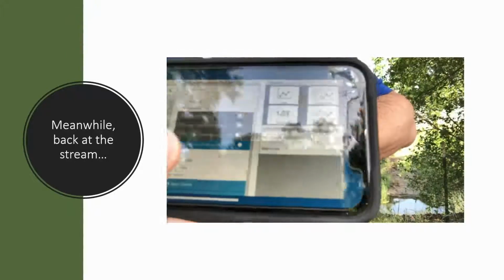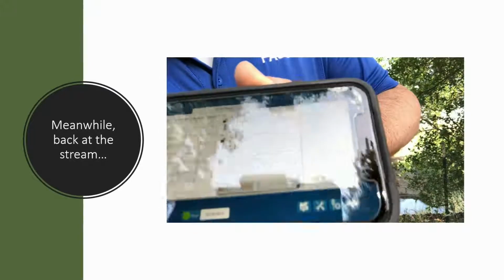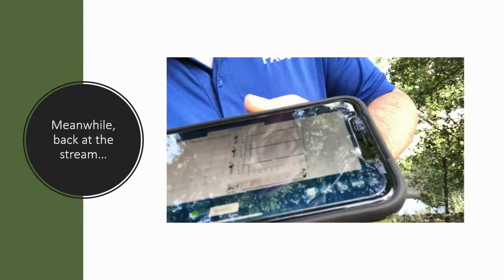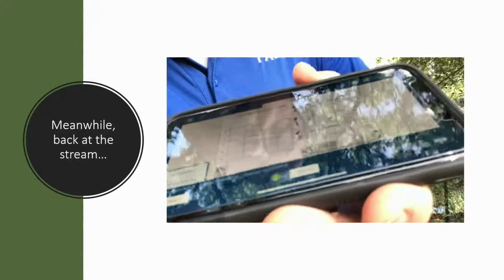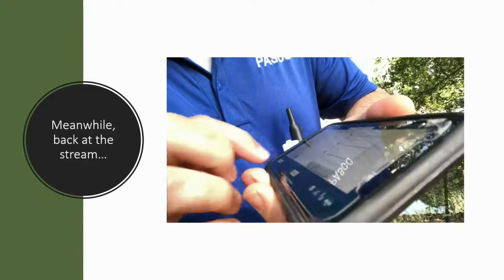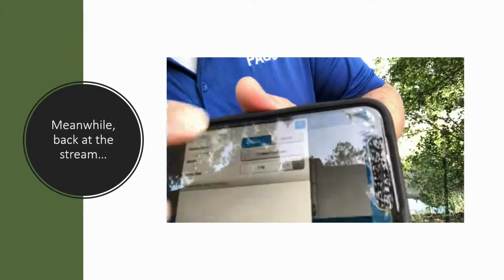I'll go ahead and choose to see a table just so that I know I'm getting the data I need while I'm out there. Okay, so I have a table and a graph, and inside of the collection type here, I'm going to choose manual mode. Oop, hold on. It says mixed, and I'm going to choose up here manual.